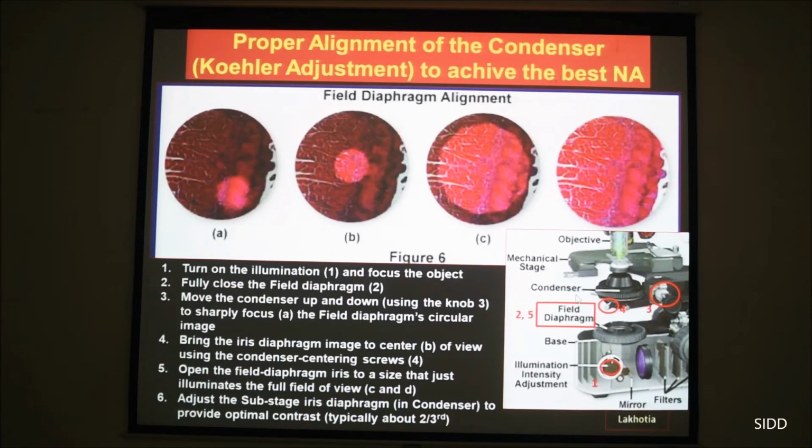Now, but the important point in microscopy is adjustment of illumination. That's the most critical point, but I must say unfortunately most often ignored point. You just see some light and begin to see an object and you see magnify and you feel happy, but you are really not getting the kind of image that you want. To do that requires, one of the systems is Koehler illumination, which requires the following steps.